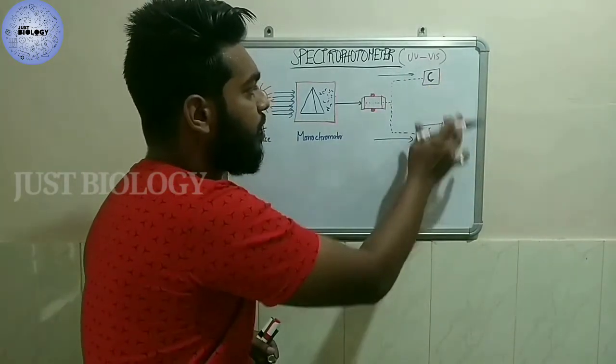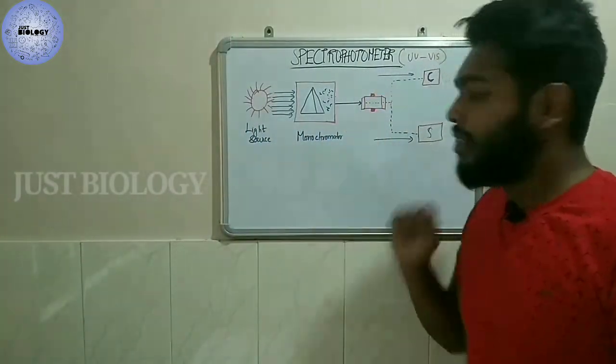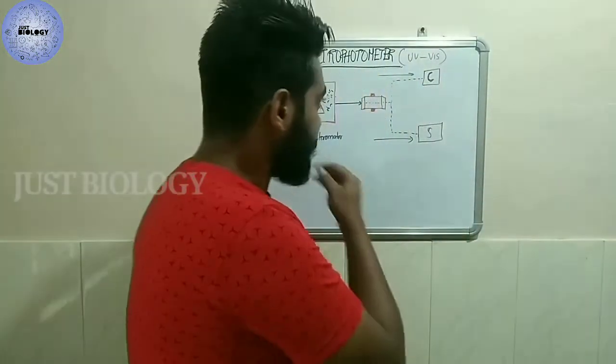We have the two chambers, and the chambers should be connected with the beam separator and other things.